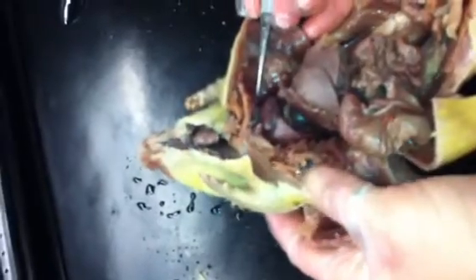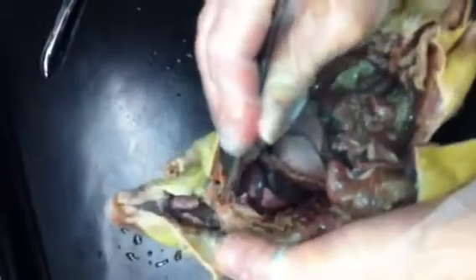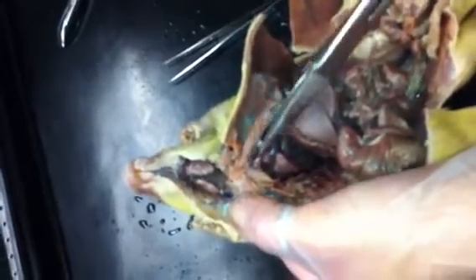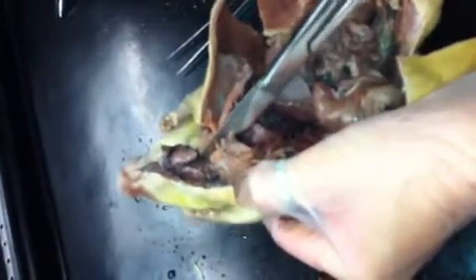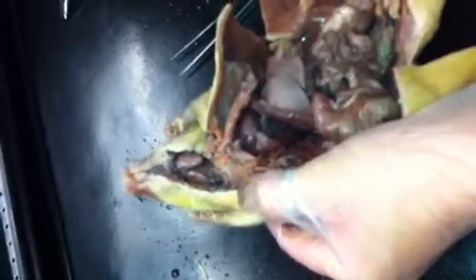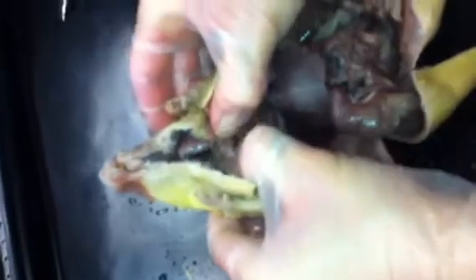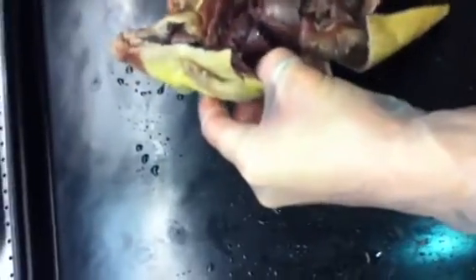So these are ribs that are covering the heart and the lungs. So what we need to do is actually still cut away some of this tissue here. And so the easiest way to do that is just to kind of insert your scissors and cut. And that sound is they're cutting through bone. So just do a little shallow cut and try to pry away. And so we're cracking some of the ribs right now. Alright.